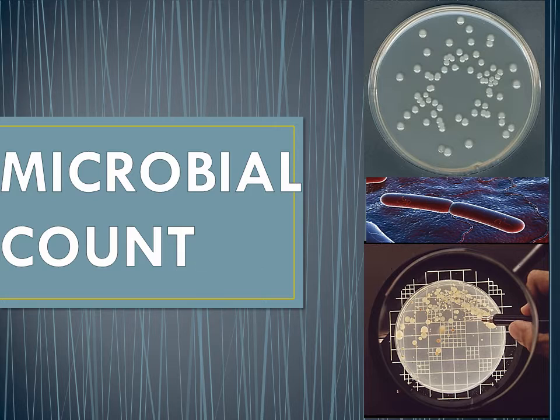It is also often essential to determine the number of microorganisms in a given sample. For example, the ability to determine the safety of many foods and drugs depends on knowing the levels of microorganisms in those products. A variety of methods has been developed for the enumeration of microbes.